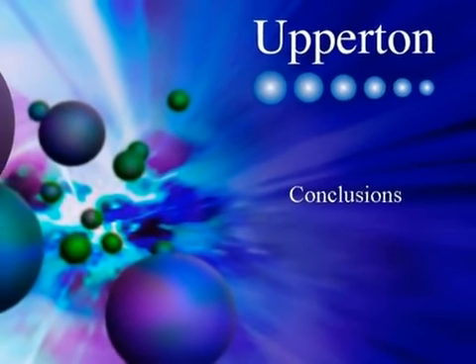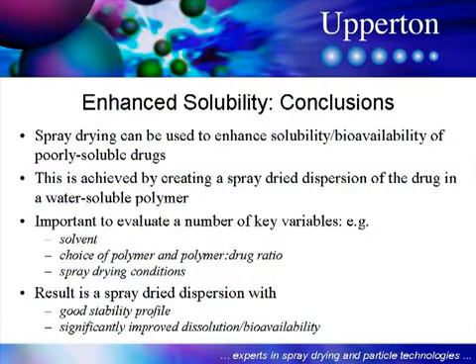So finally, in conclusion, I'd like to confirm that spray drying is now being widely used to enhance the solubility and bioavailability of poorly soluble drugs. This is achieved by creating a spray-dried dispersion of the drug in a water-soluble polymer. When you're creating your spray-dried dispersion, it's important to evaluate a number of key variables.